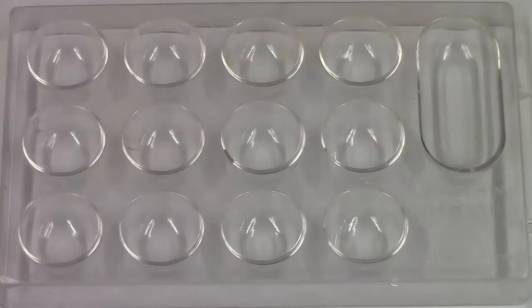So the purpose of this lab is for us to be able to look at different types of chemical reactions, identify the type of reaction they are, and predict the products of those chemical reactions.